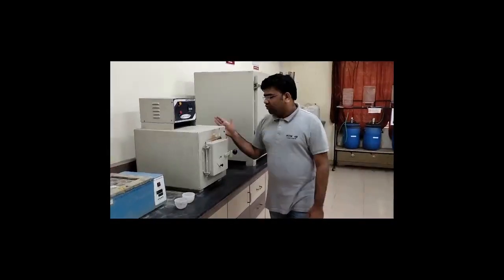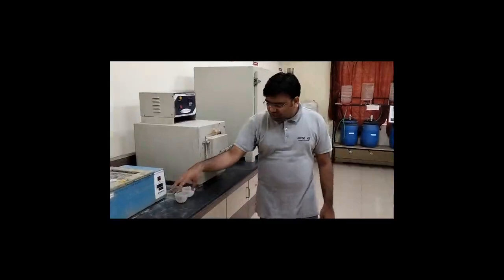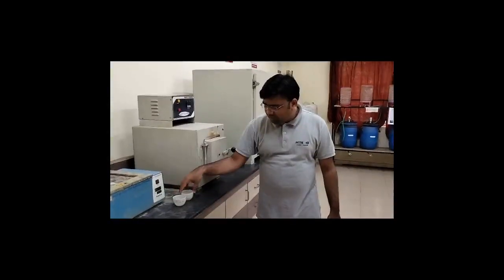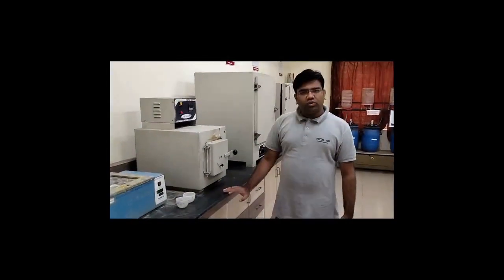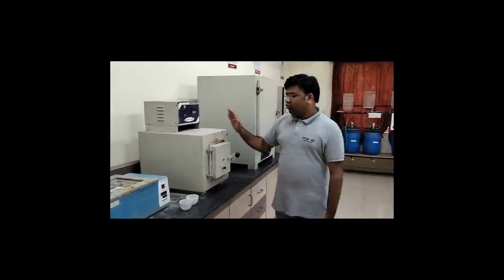So the heat that we are going to provide in this muffle furnace is 500 to 600 degrees Celsius, and we are going to keep these crucibles for half an hour. So these are the same crucibles that you can see, A and B, that we used for total solids. And amongst the total solids present in this crucible, we are going to utilize the total volatile solids. So now the care we have to take: firstly, you don't have to switch on this muffle furnace immediately.